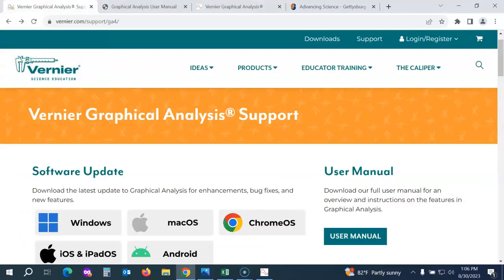There are two different ways that students can connect to the probeware. The first option is to install the desktop app. Go to Vernier's website, search for Graphical Analysis, and there is a free option available for a variety of different platforms. There's also a paid option. This video will talk about how to use the free option, which we found to be sufficient for our needs.